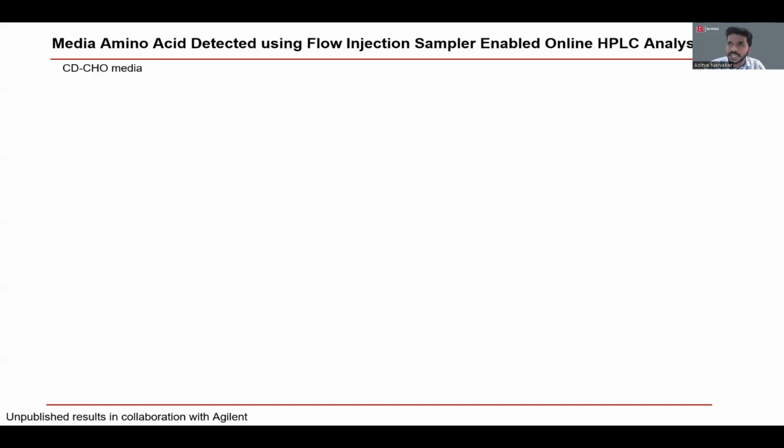Now, there are several things that have to be standardized while setting up this amino acid analysis workflow, like the sample transport solvent. The sample is going from an injection, the external valve. When the sample is transported from the external valve to the autosampler of the HPLC, it is important to have a transport solvent. So taking care of the right transport solvent, the sampling speeds, and other parameters is very important while developing online workflows. So using an external valve is challenging in some of these aspects.